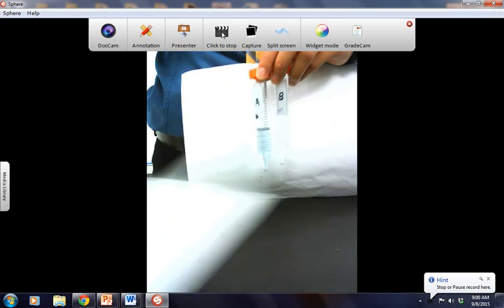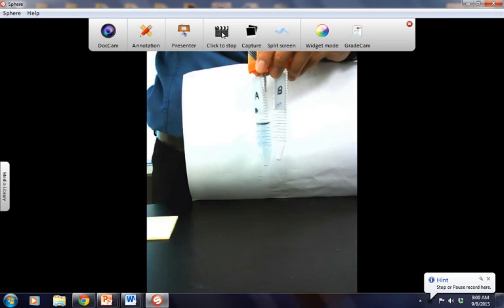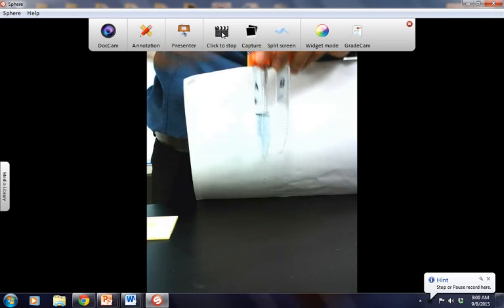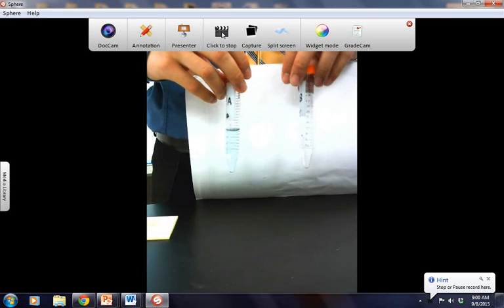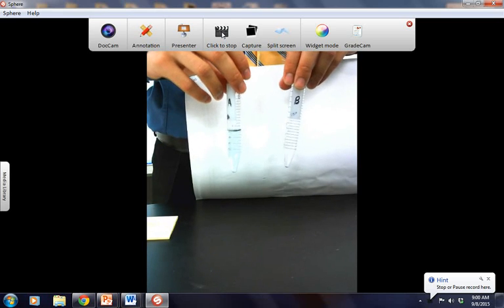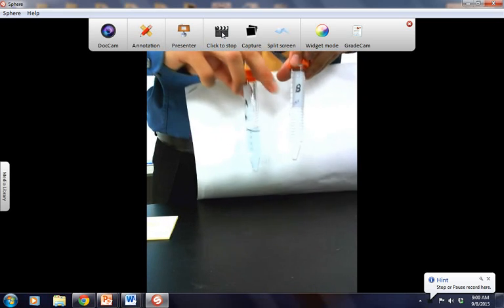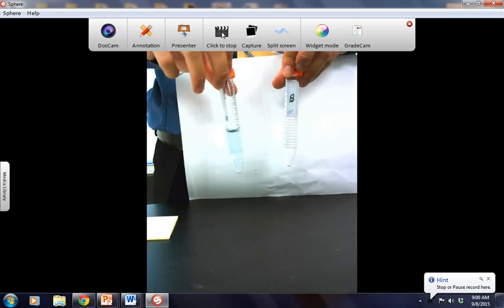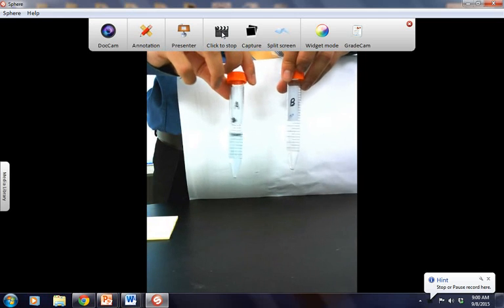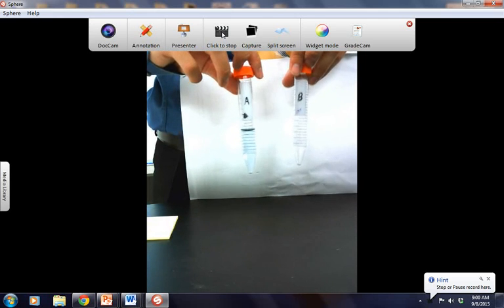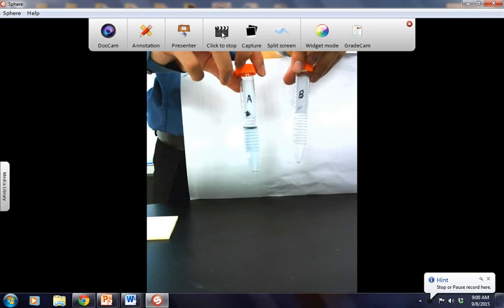Go ahead and flip to the back of the first page and answer questions nine and ten. For experiment two, here's what we're going to do: we're going to take test tube B, which is completely full, and empty out half so that the volume equals tube A.